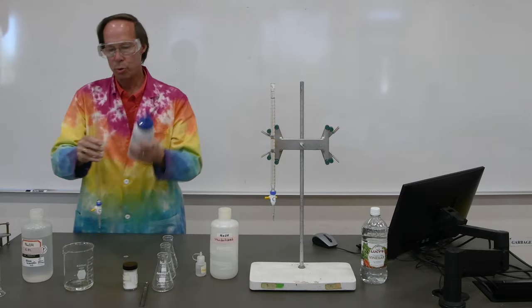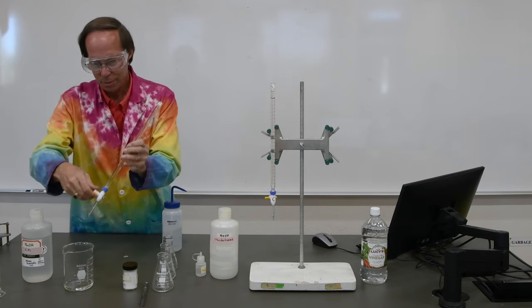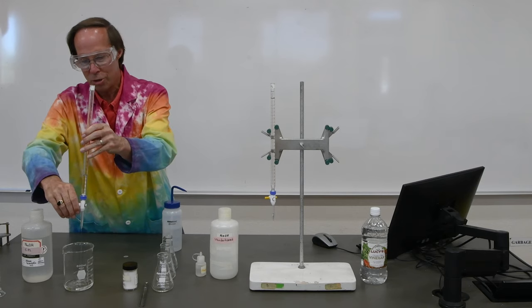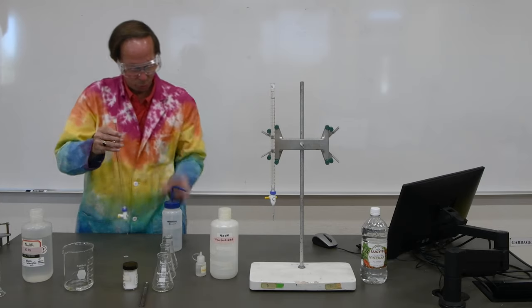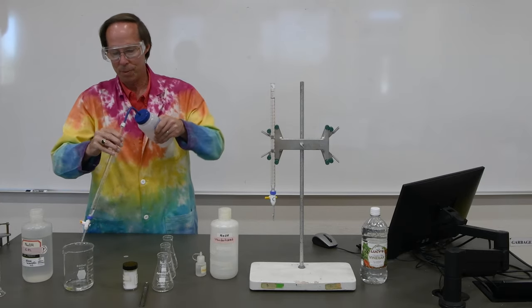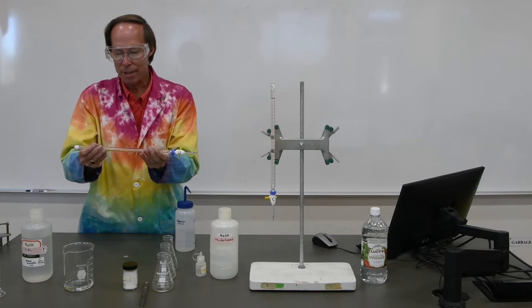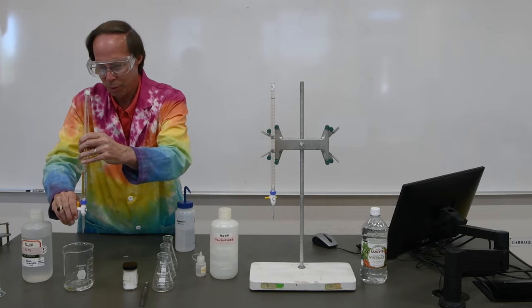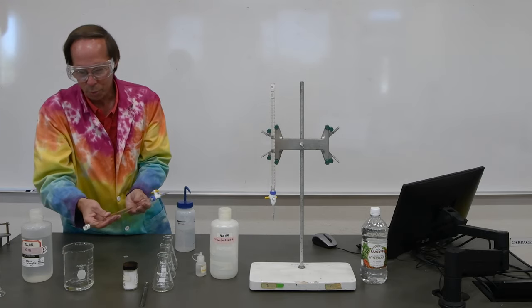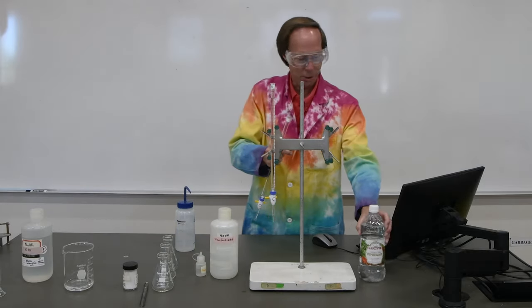So let's go ahead and do a couple of rinses with water, like we did before. We'll drain that out. We're going to make sure there's no contamination here in our burette. And let's rinse it with water one more time, just to be thorough. I'm sort of swirling the water around to make sure it rinses anything off the sides of the burette. We can let some of it flow through, and then we'll simply drain the rest and swirl it to rinse that out. And now we're ready to fill it with the vinegar.